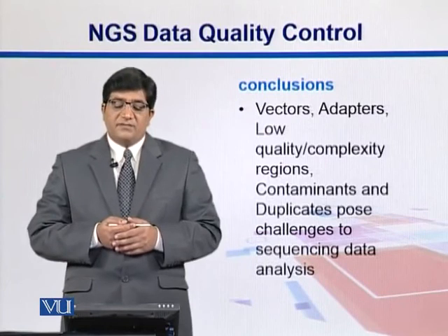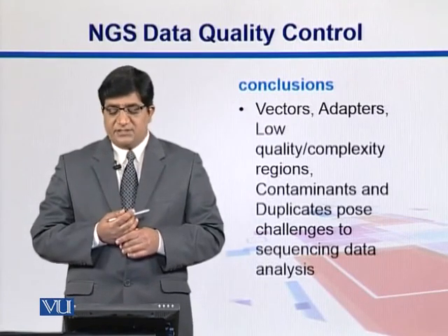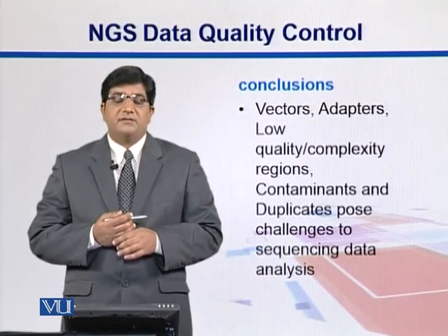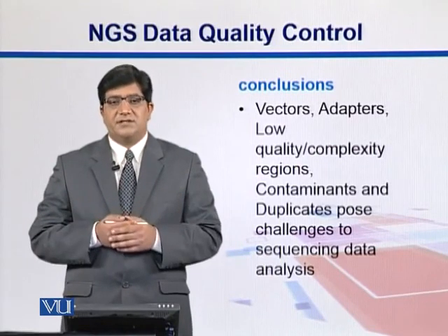So what we have seen so far is that data quality is an important issue to deal with in NGS data analysis. Vectors, adapters, low complexity, quality, contaminants and duplicates, all of them pose specific challenges to NGS data analysis.